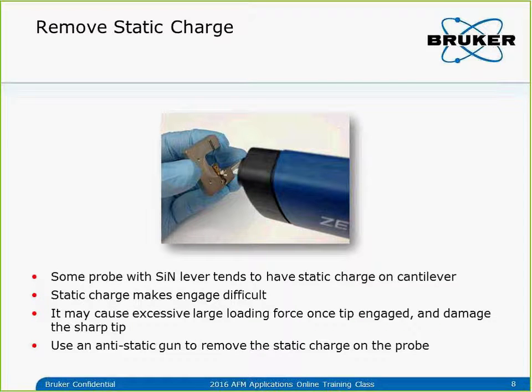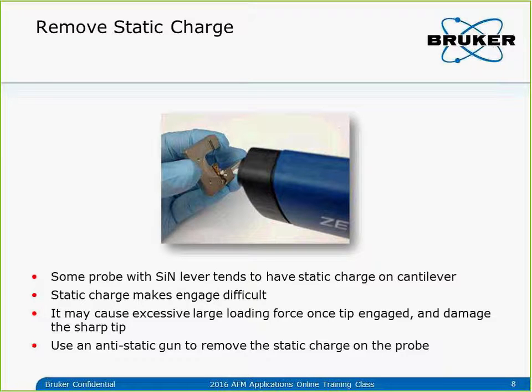Then we can mount a cantilever in the holder. We need to use a new fresh probe. I use SNLC, but you can also use SNLA or the ScanAsyst Air probe — they're all capable of this imaging and have a sharp tip. All these probes have a nitride cantilever. I found that the nitride lever tends to have a static charge on the surface. If there's a static charge, when we try to engage the tip on the surface, this long-range static force will keep bending the cantilever. As the cantilever gets closer, the static force gets stronger and the cantilever keeps deflecting.